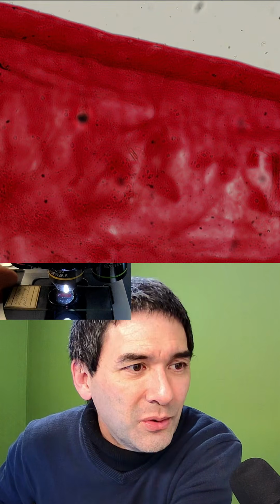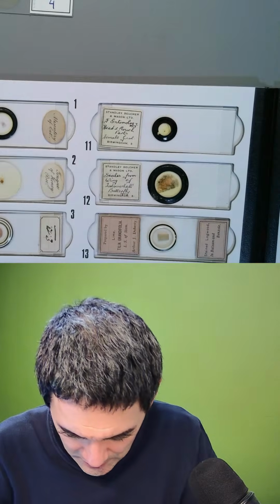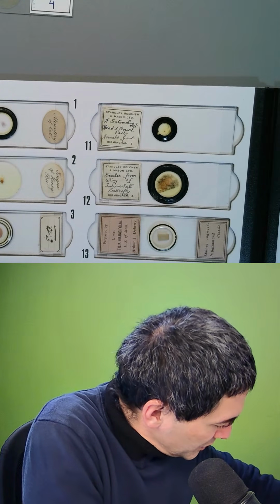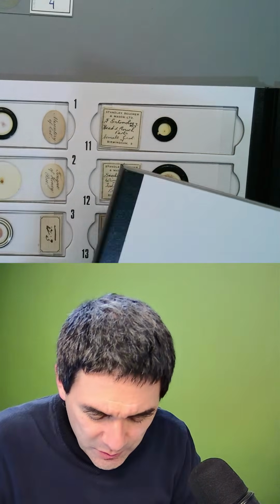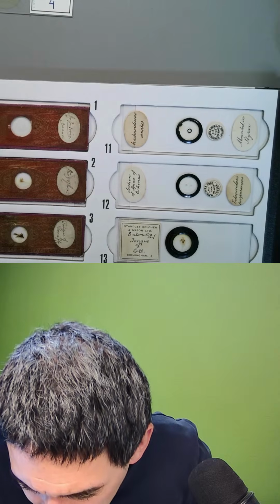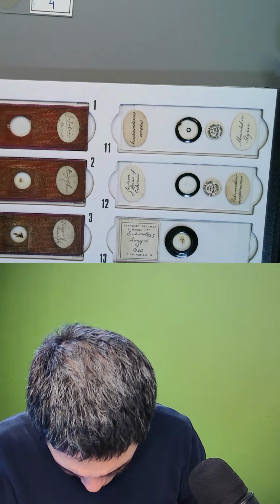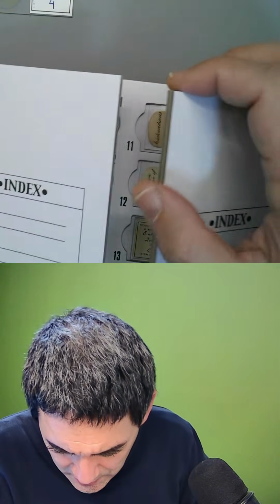Okay, so let's have a look again over here. So I'm gonna put it back. There are a couple of others that I wanted to show you. Some nice ones. Let me see if they're over there. Let me see, and what do I have over here? Nope, that's empty. So let's have this one over here. Where are they? Where is this? Entomology B. Where did I put them? Maybe this is still in here.